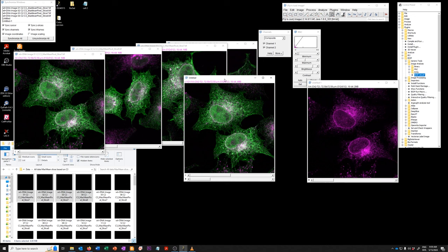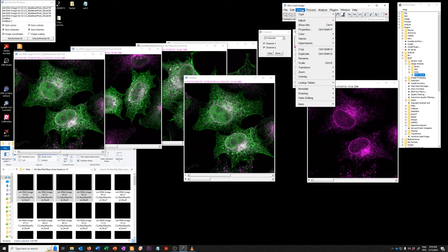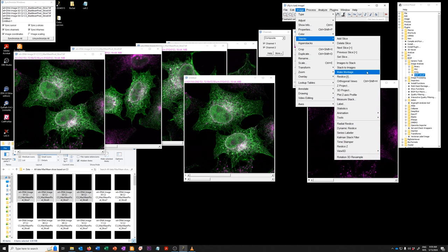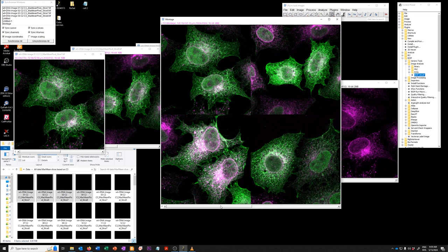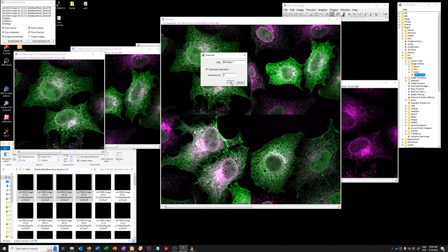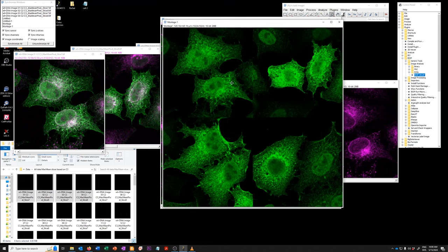You can also make a montage of these. I'm going to use a scale factor of one. So this is a two channel montage. And by using the duplicate command, we can turn it into a one channel montage and so on and so forth.